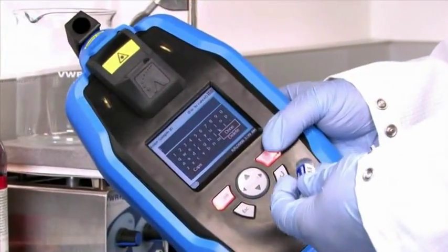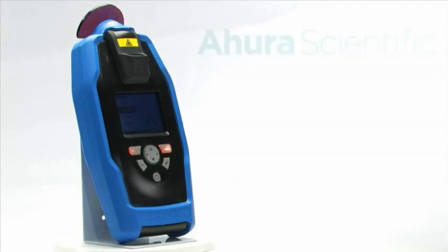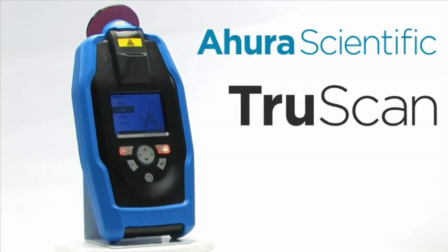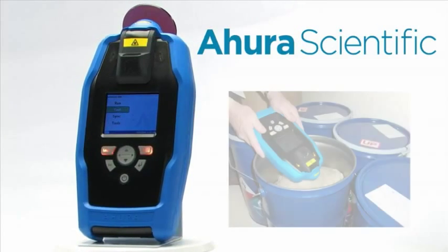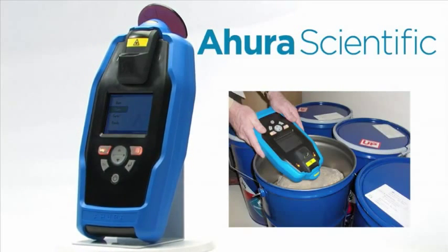In conclusion, with TruScan, Ahura Scientific puts a powerful portable material identity verification technology into the hands of the pharmaceutical industry, helping to reduce costs, improve test throughput, and protect brand security.